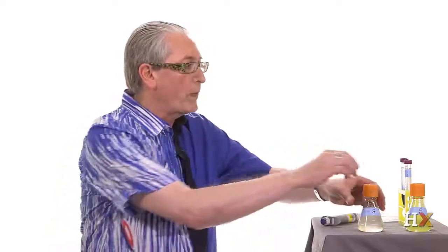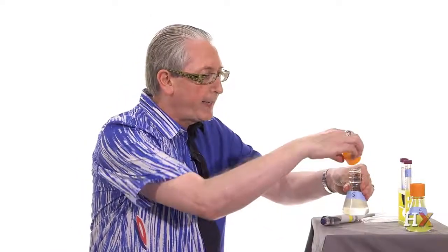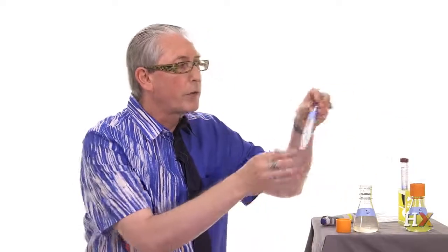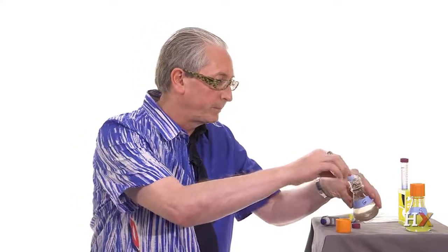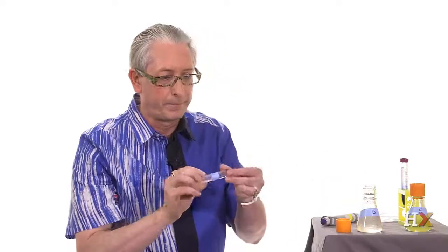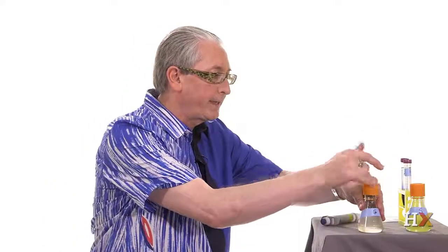So what I will do, I will take my flask and add to it some glucose at a very high concentration. Here we go. Okay. Now I can close my flask again. And the next thing I have to do is to mimic the activity of a person.